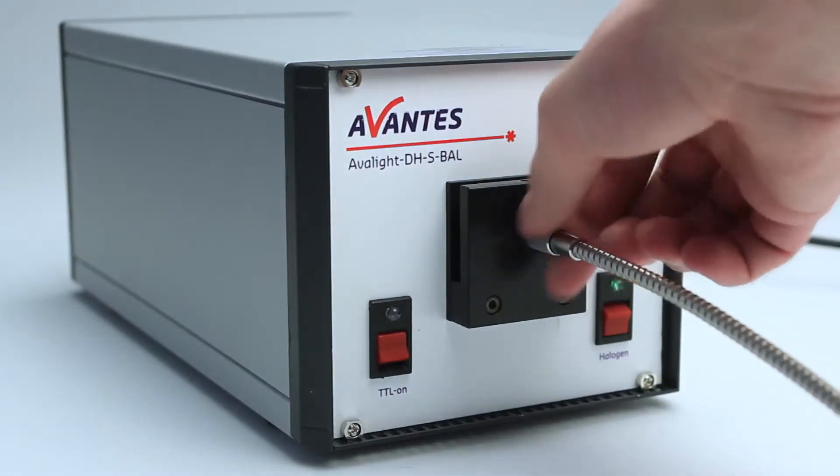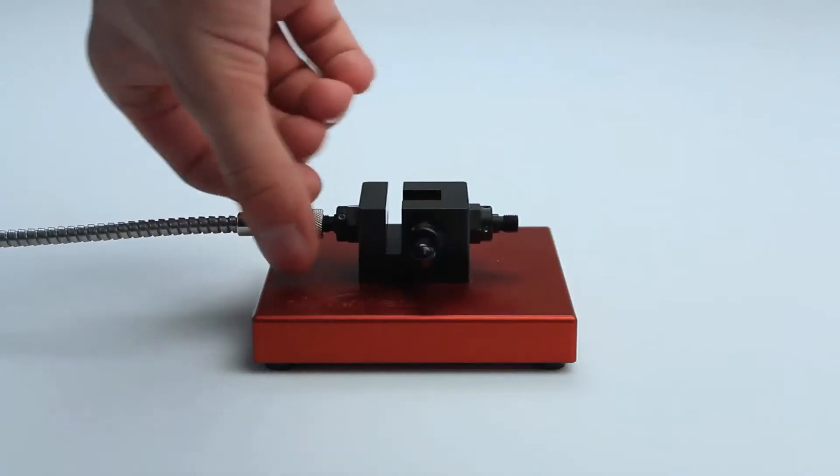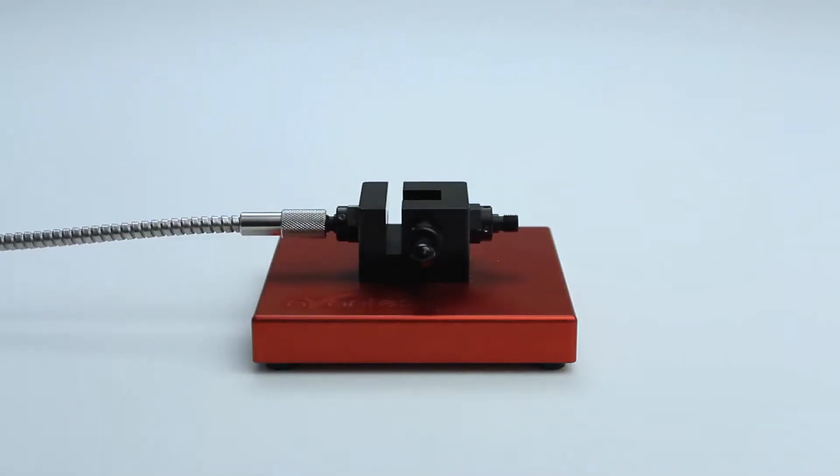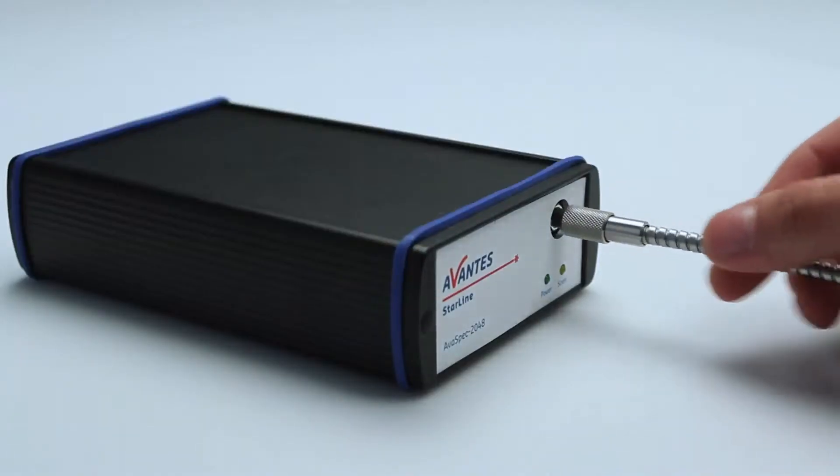Start by connecting the light source to the cuvette holder. Afterward, connect the spectrometer to the cuvette holder.